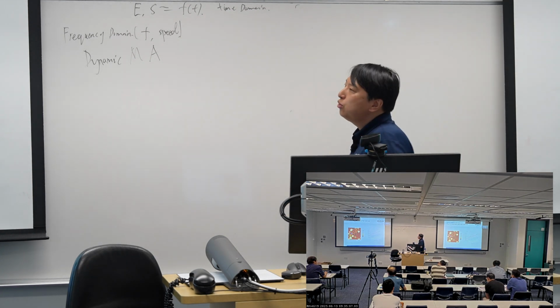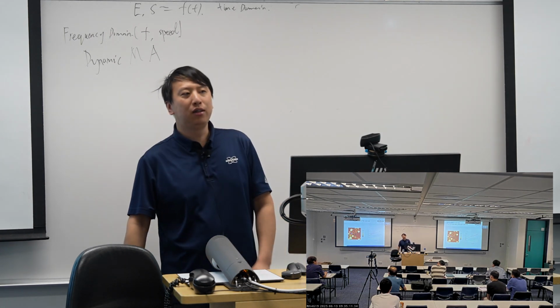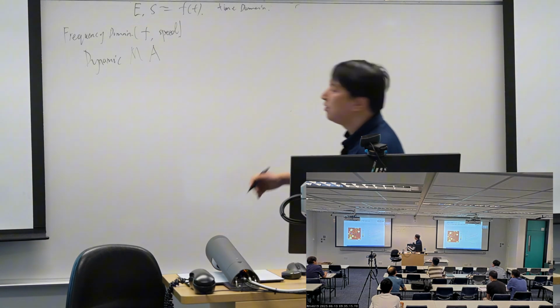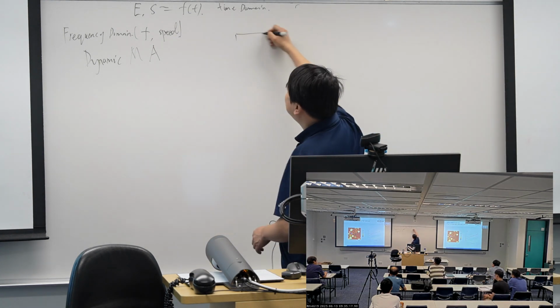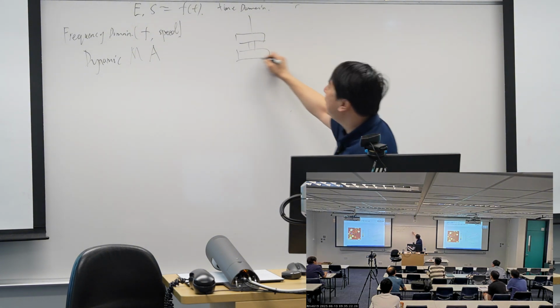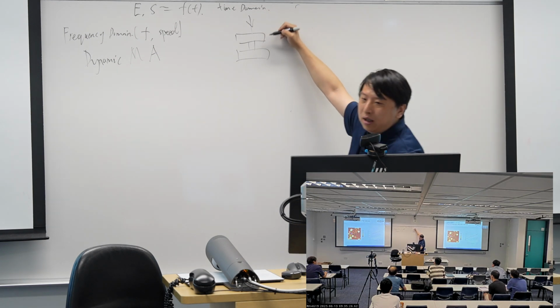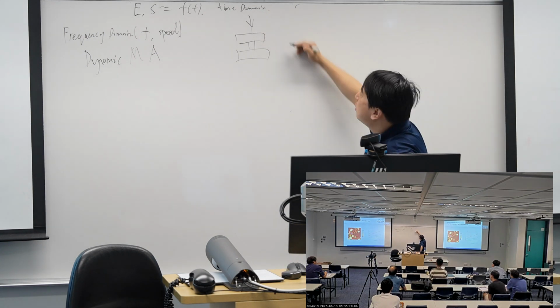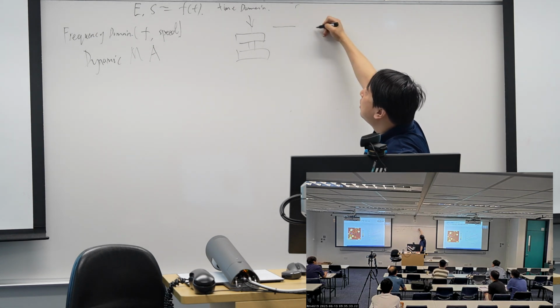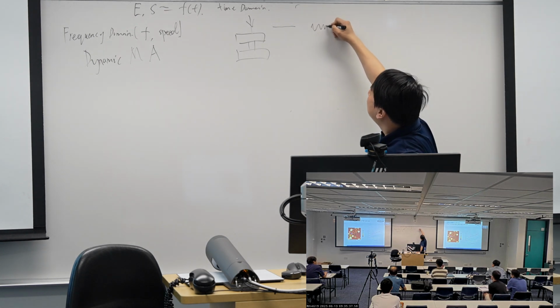So for DMA, usually when you watch the macro scale DMA in our facility, you can see it will also have a stylus, and you put your samples on the sample plate, and this stylus can apply force on your materials. But this time it's not a constant force, but a dynamic force or a periodic force.